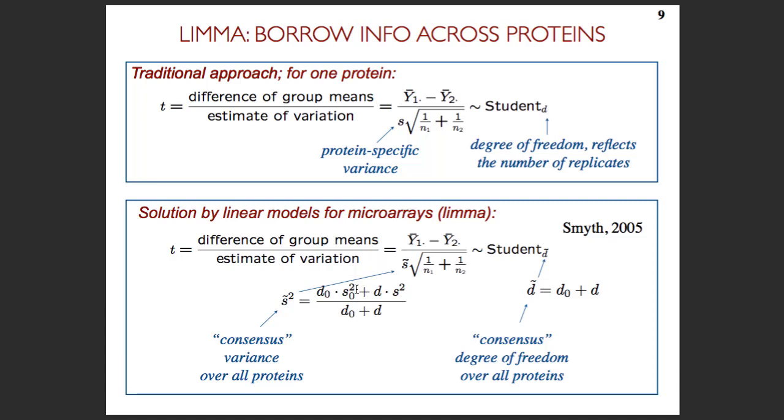So this is kind of what I mean. We're trying to minimize the assumptions that we make. And that's the reason why we didn't really include this in MSstats, because it's an extra layer of assuming things. And I'd like to say that if you assume enough, at some point your results reflect your assumptions a lot more than they reflect your data. And we kind of try to make the data speak as much as possible. So that was our philosophy. But again, methodologically, there is no problem at all to add this on top of what MSstats is doing.